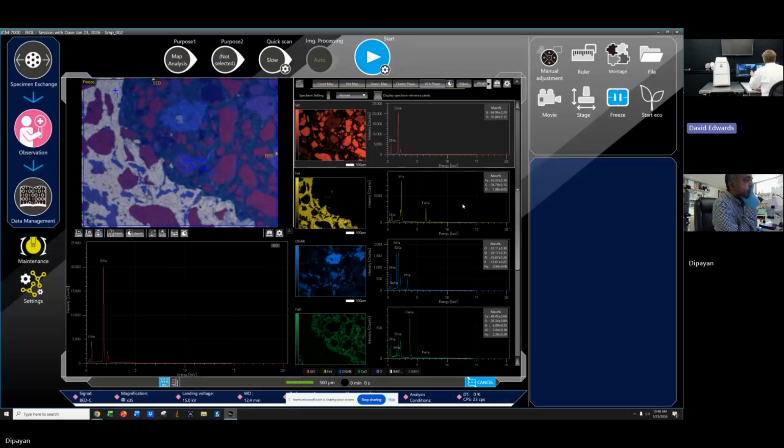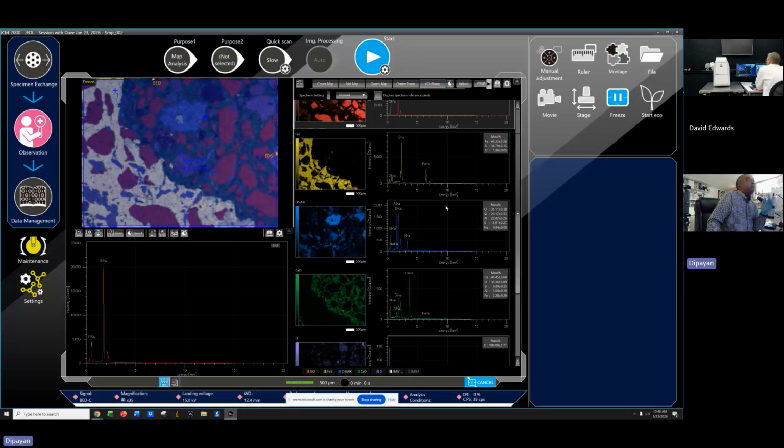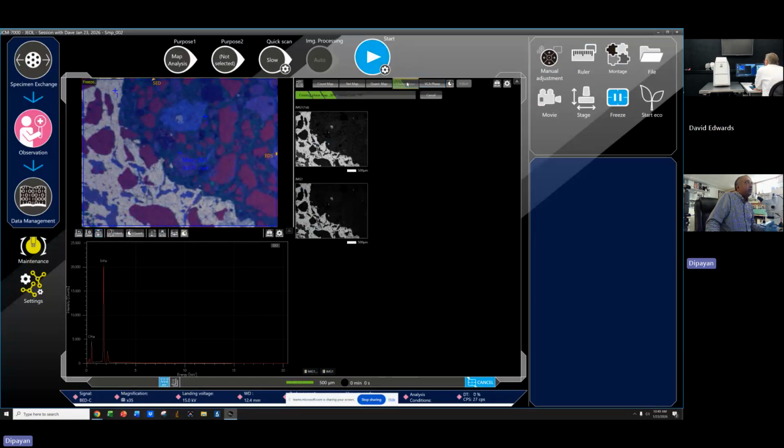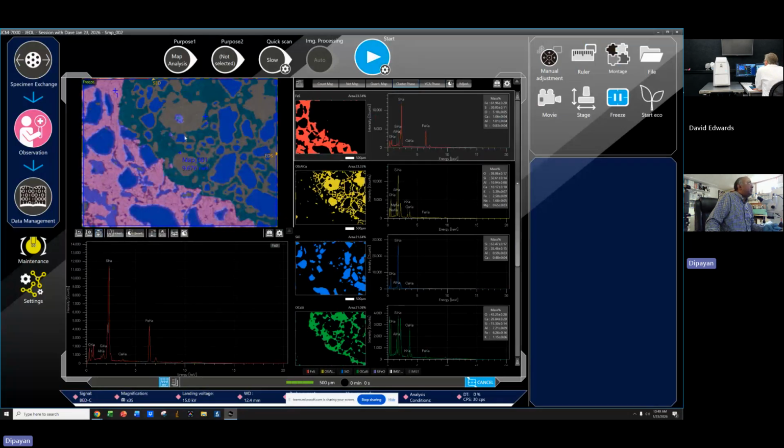And so it just gets darker. Same color, just darker. So many times I do either an elemental map, if the elemental map looks better for me, or I do a phase map. Usually I don't try to go to, in this case I wouldn't do VC, I would go to cluster phase directly. Let me go to cluster phase, and now I'll get a much better image here.